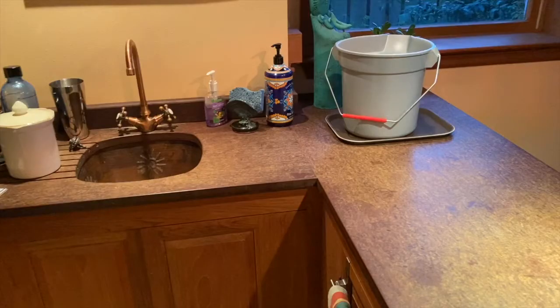So first of all, we need to think a little bit about where we're going to implement our experiment. For many of us working at home, this will be a kitchen or other shared multipurpose living space. So besides our own safety during the experiment, we need to be thinking about others sharing this space over the next 9 weeks. One of the first things you probably want to think about is where to store the KOH safely when you're not there, and how to keep others from inadvertent harm.